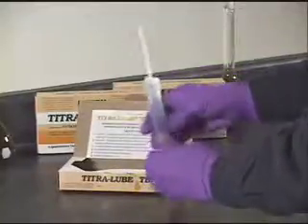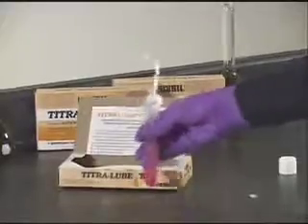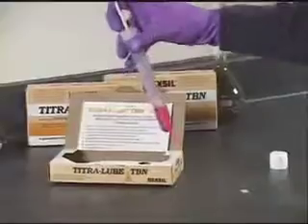The color should change to a bright magenta color. Now, add the titrant dropwise to the solution, swirling the solution after each drop.